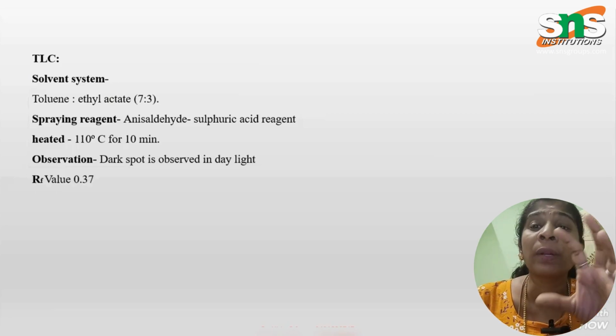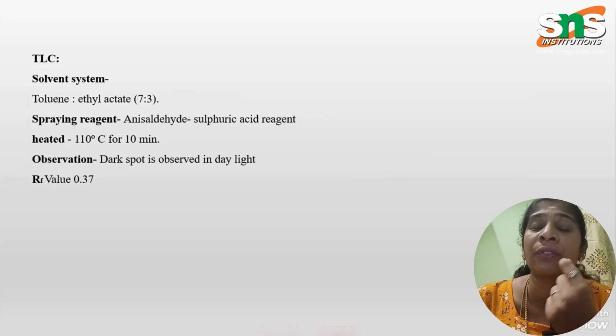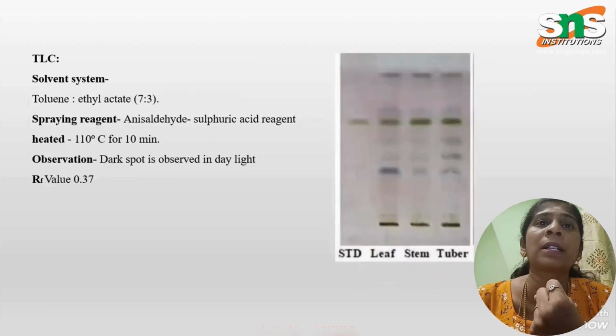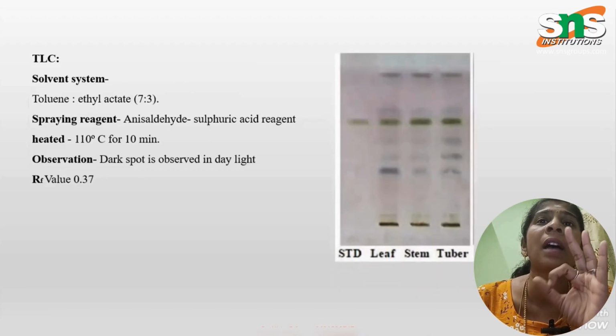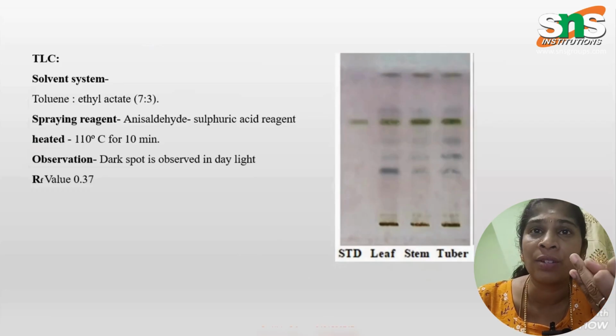We need to identify whether it is diosgenin or not, so we take it for identification tests. The first one is the Liebermann-Burchard test, where we observe a positive green coloration, which confirms the steroidal nucleus present in the diosgenin particles. Melting point: pure diosgenin melts at approximately 204 to 207 degrees Celsius. See how high it is. And the yield depends upon the plant source and efficiency. Isolation of diosgenin demonstrates glycosidic hydrolysis, highlights industrial drug synthesis, and is a classical pharmacognosy practical.